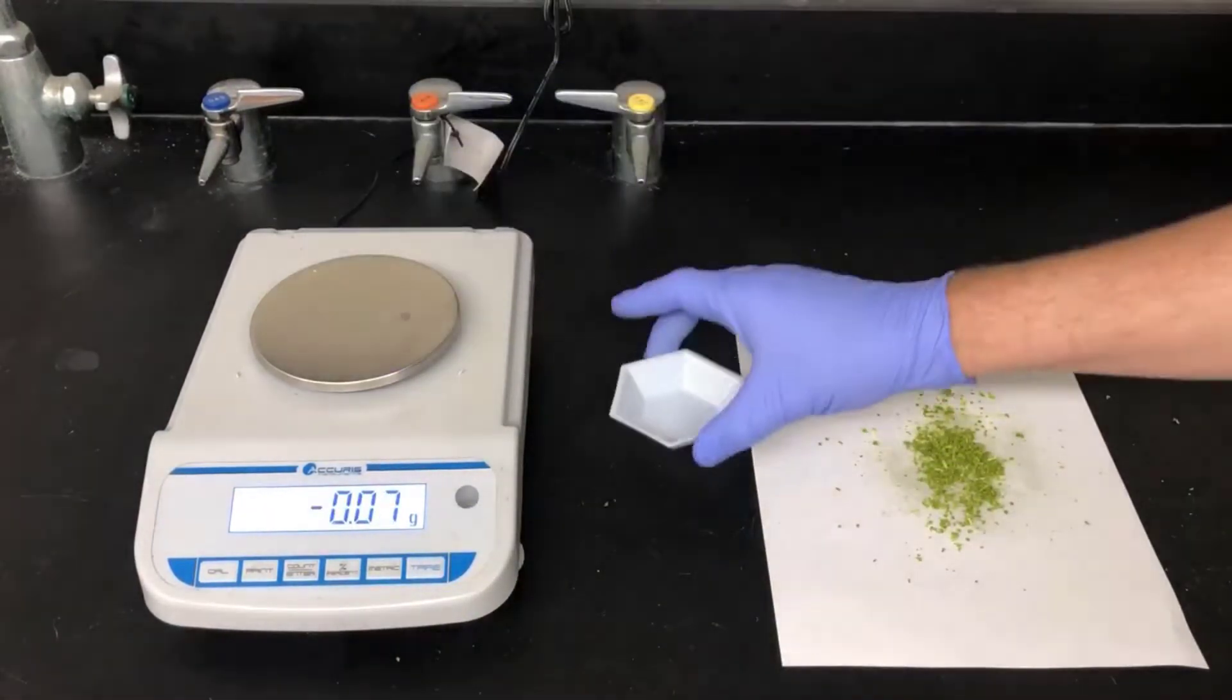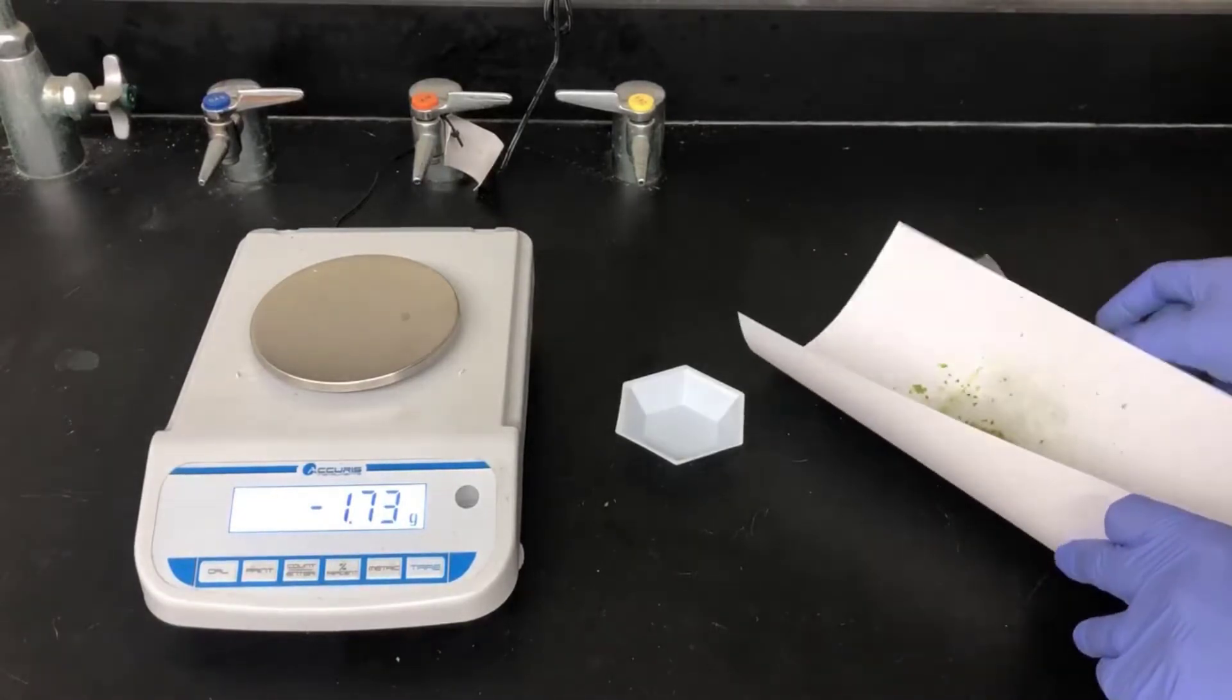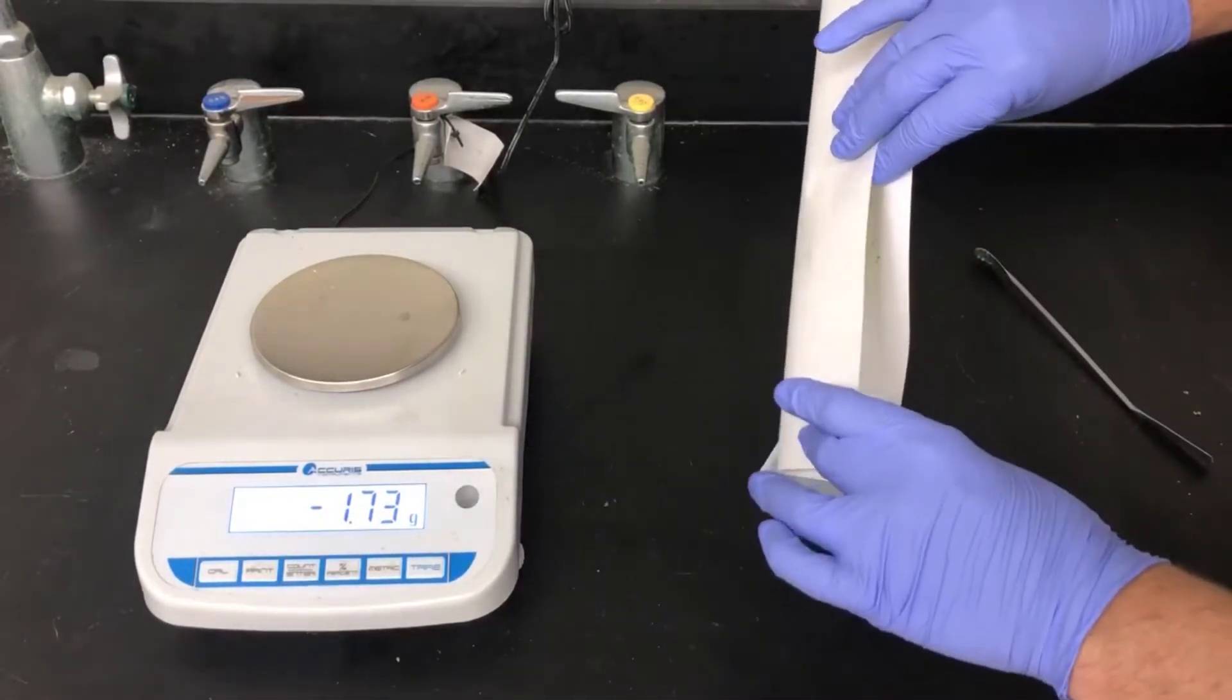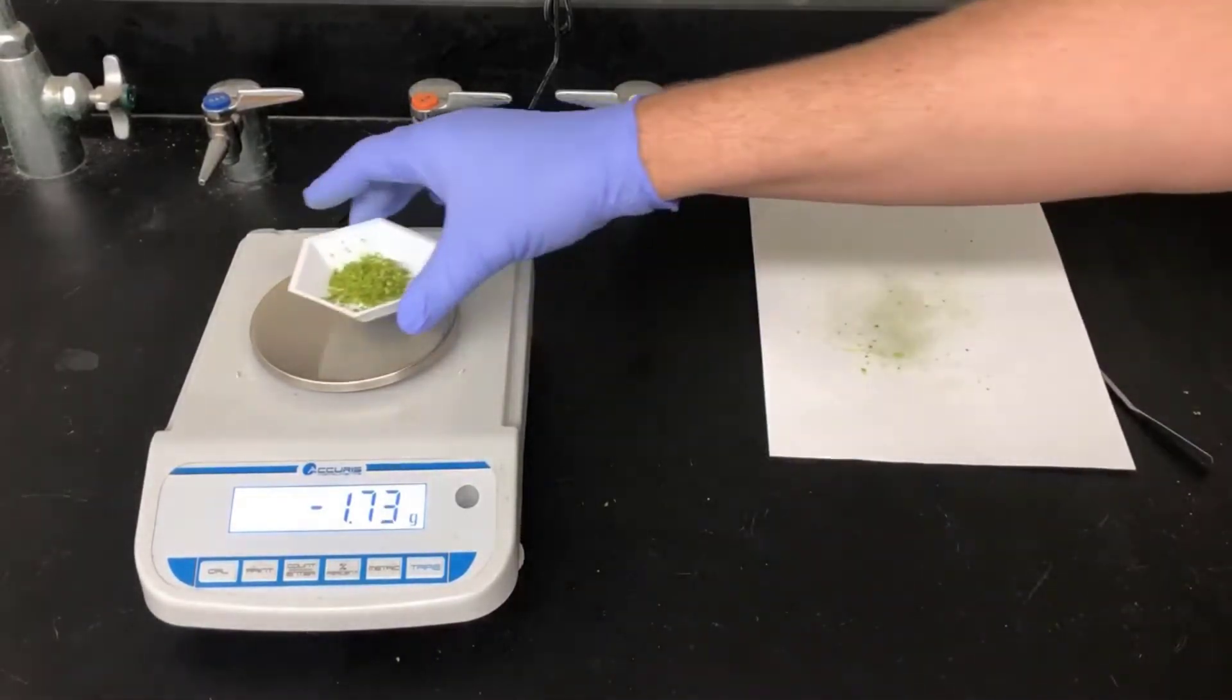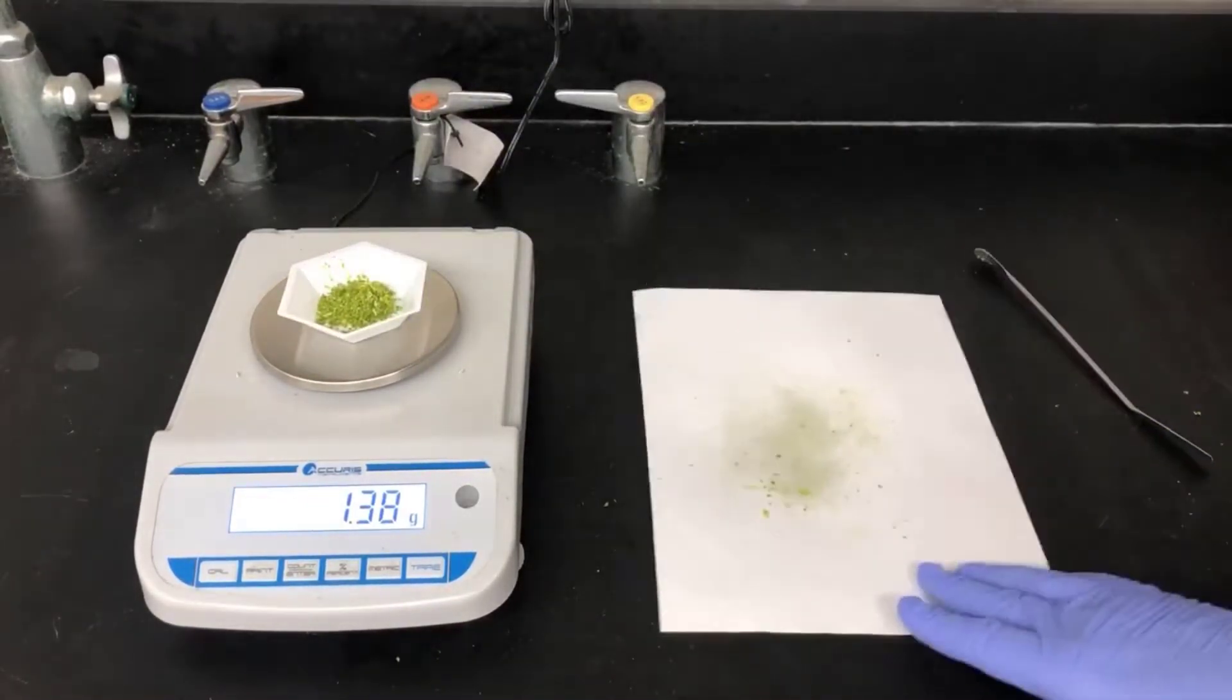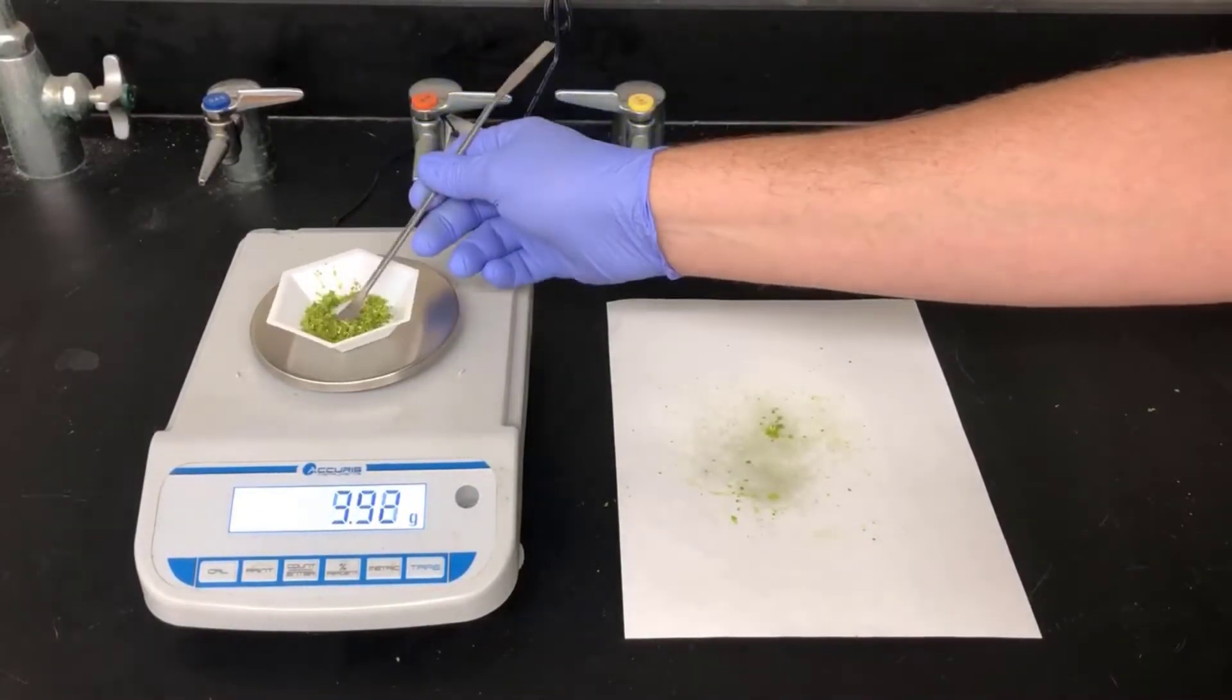I'm using a disposable weighing boat here to weigh out the lime zest. I'm curling up the paper here to funnel it into the weighing boat. The lime zest is a little bit sticky so you might have to use your spatula here. And I've grated out 1.38 grams of zest. This is a little more than I need and I'm going to remove some here so I can get closer to 1 gram.